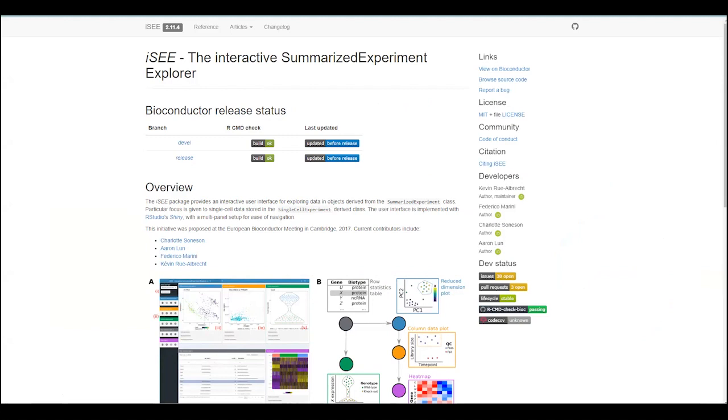Flow cell data, Joe. Joe's question is, I missed if MetaCyto works for flow cell data. What type of flow cell data? Do you have any more information? I don't. I may be out of date. When I think of flow cell, I'm thinking of sequencing. But I do not know off the top of my head. It's a flow cell sorter. Other people will be working with it. Yeah, I'll have to get back to you guys on that.